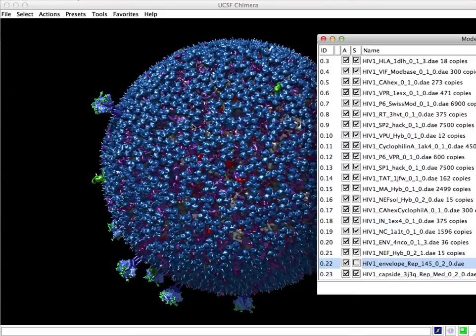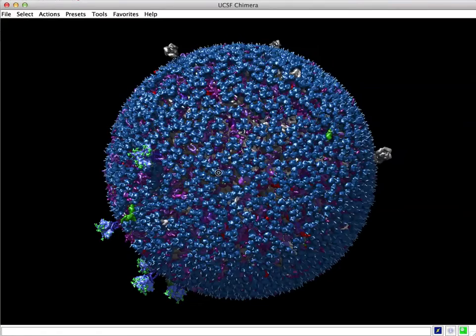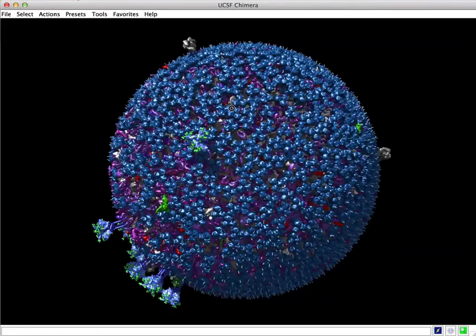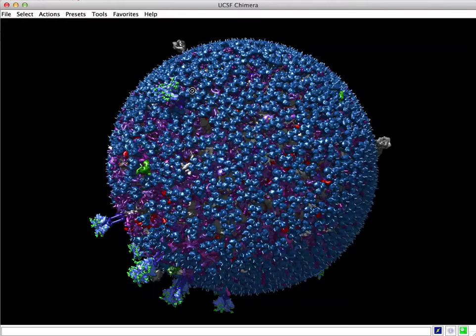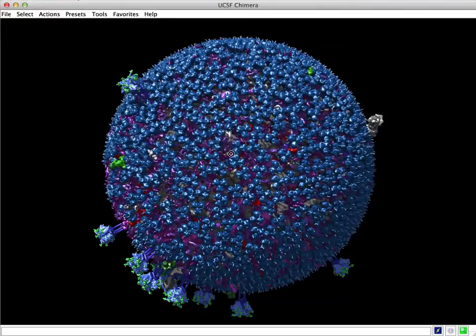Hi everyone, it's Graham Johnson. I want to show you a very quick tutorial of how to view files, Cellpack files, using Chimera.